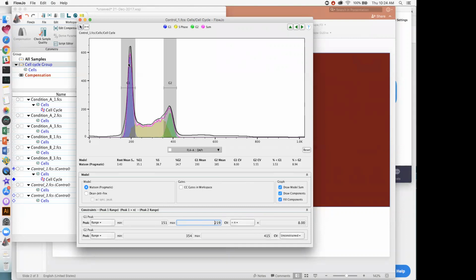The reason there is not a single column here and that there's actual spreading going on is because, again, the cytometer has photon counting error, just like every other instrument that we use in the lab. There's an error rate, in this case roughly 7 or 8%, in terms of the photon counting error.